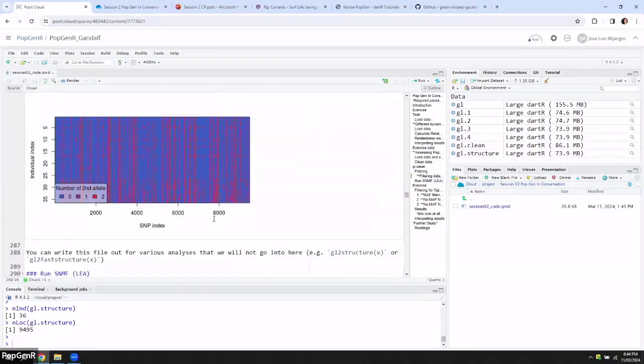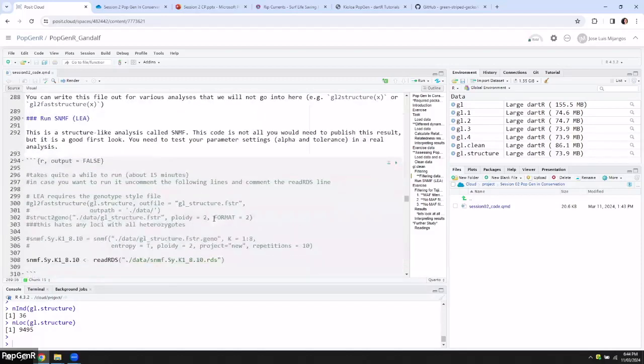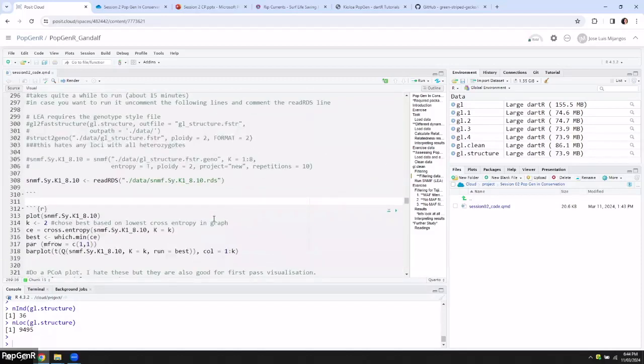Okay, so yes, we end up with our cleaned up data set. And so this is a maximum likelihood version of structure called SNMF. Sorry, Renee? Yes, another one. Sorry, I just want to mention that in Dart you can select the method for filtering out the secondaries. Yeah. So it has method and you select random, or you can select best. And I don't really know what best means, so I just make sure that what's left is best and then select random.